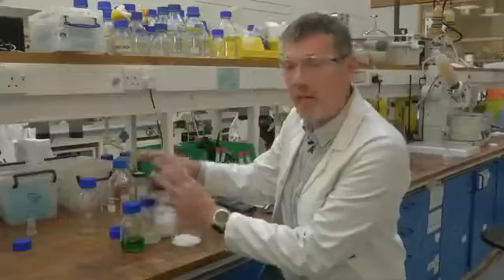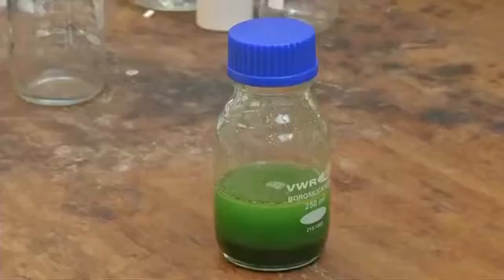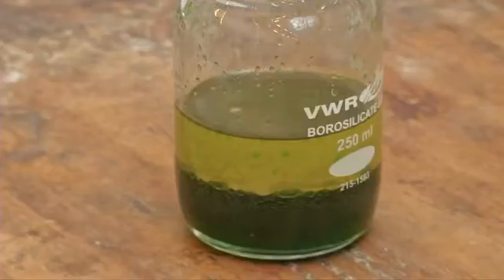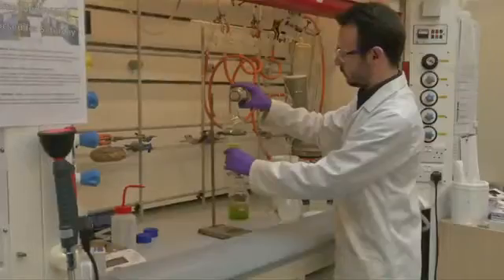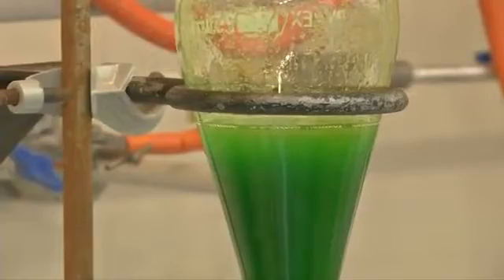When you mix them together you get two layers, and if you give them a good shake you actually extract all of the gold that you have dissolved in this mixture of mobile phone metals, and that goes then into this layer here. Love says the method is inexpensive and could help reduce the negative impact of gold mining and cut CO2 emissions.